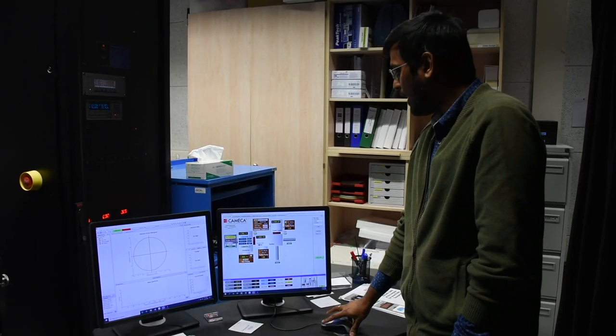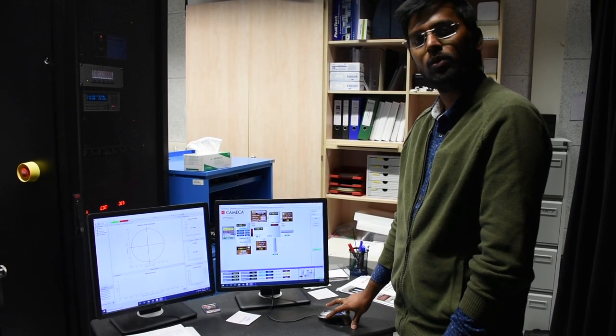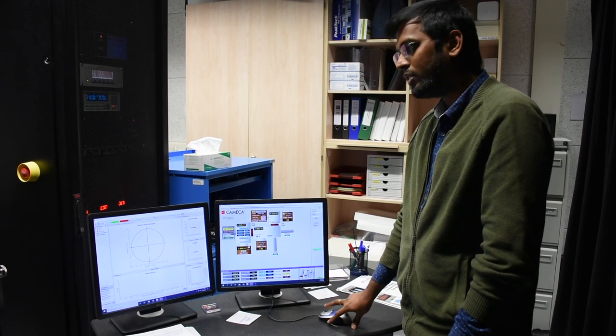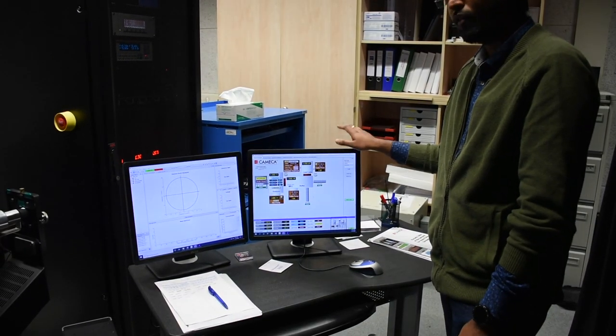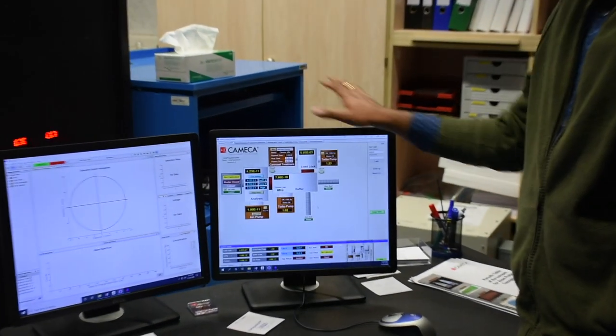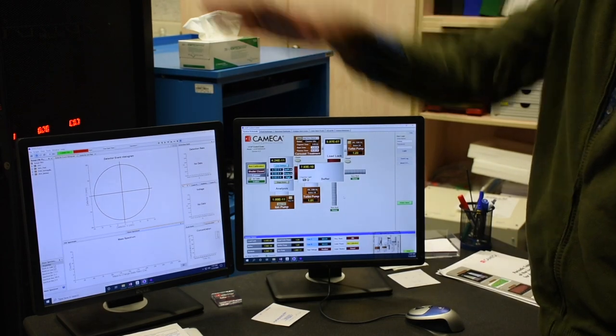Now that we have loaded our sample, we want to move our sample from load lock to the buffer chamber. In order to do that, we have the LEAP Control Center, which is a software from Cameca itself, and this is the only software which we use to control all the systems inside our atom probe.